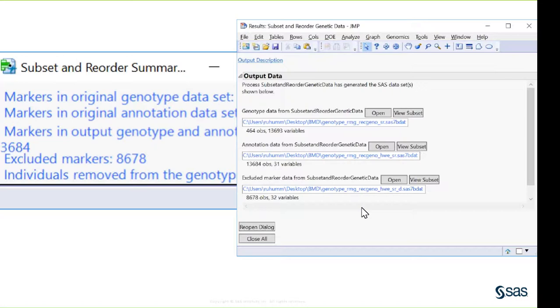You've got a couple of ways to use JMP Genomics. One is with workflows where everything is like a pipeline and it's almost hands-off - you make decisions at the beginning and the software pushes the data through from stage to stage. Or if you want more autonomy, you can use the individual processes where each step tells you where the output data is and you feed it into the next piece.